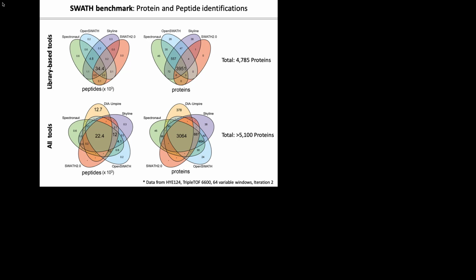This is also a good thing for reproducibility issues, but it also precludes, I think, endless cycles of students going and trying to optimize their search tool. And we have experienced this ourselves in the field of mass spectrometry, that when someone comes up with a new search tool, for instance, in DDA mass spectrometry, there must be now dozens of search tools. Everyone writes a paper and says, my tool is better, it sees more proteins than all the other tools before. And then inevitably someone from the lab goes and says, I want to test that.